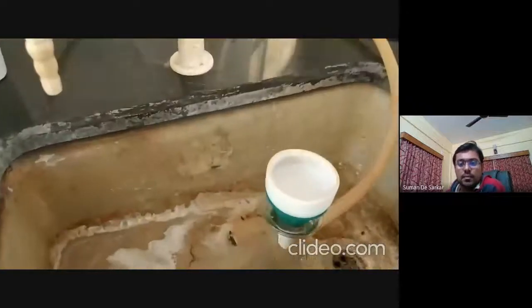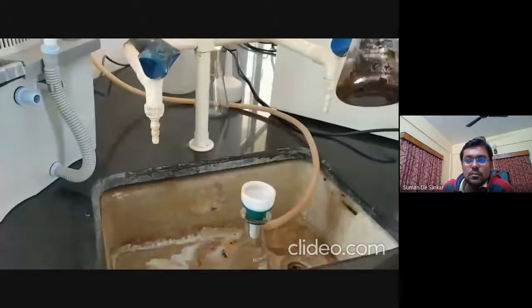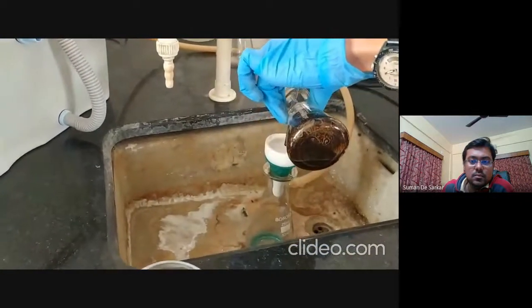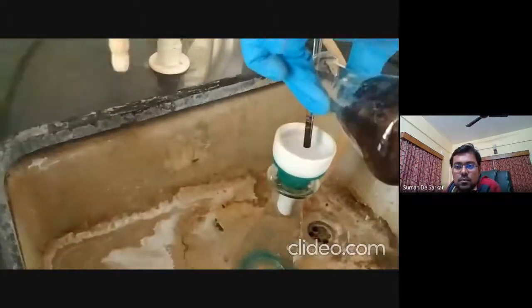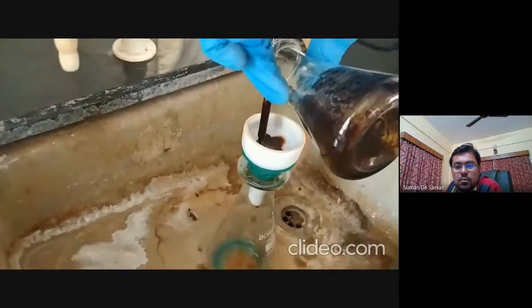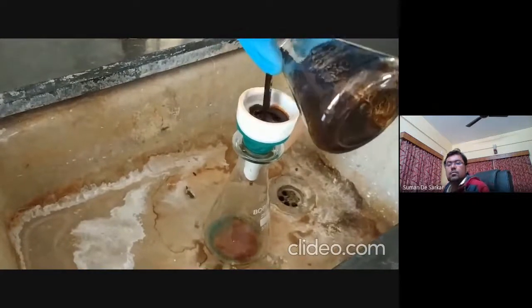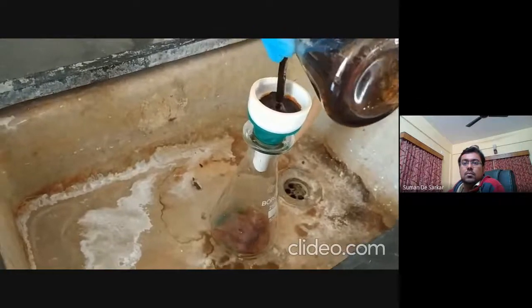On top of the Buchner funnel, we have set up the filter paper, and now we are adding our reaction mixture onto the Buchner funnel. So the indigo is collecting on the filter paper.